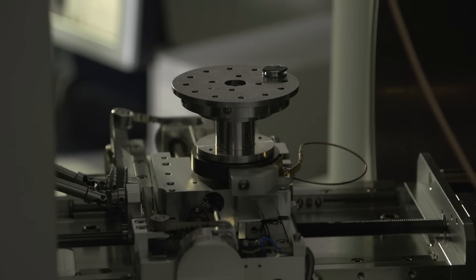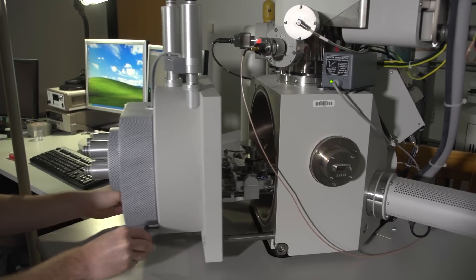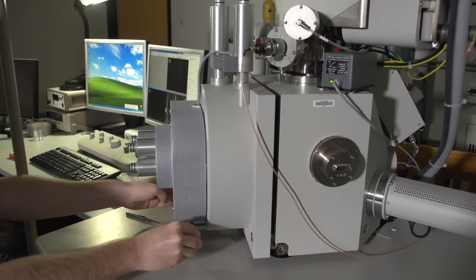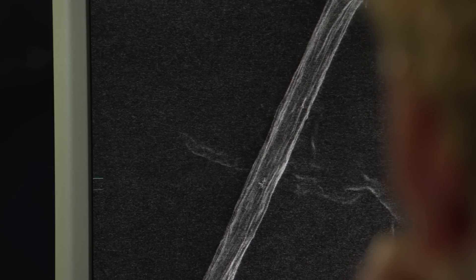The machine we're sitting near here is the SEM, the scanning electron microscope. We use this to do higher magnification imaging of the surface of our fibers so we can get an idea of what the structure is on a microscopic scale—a couple of micrometers or a few nanometers, tens of nanometers.